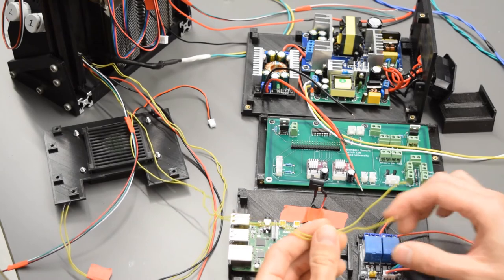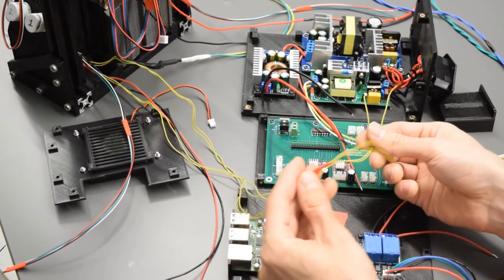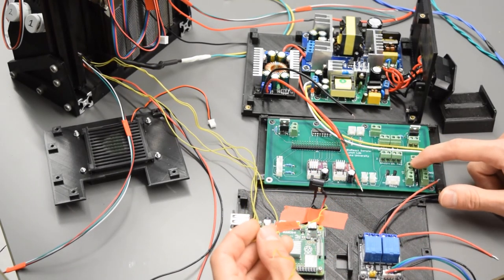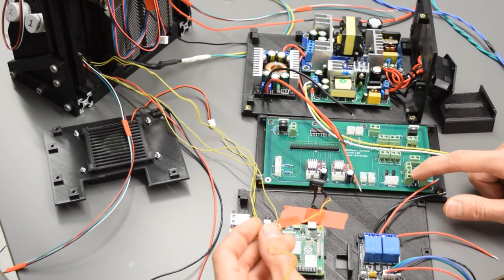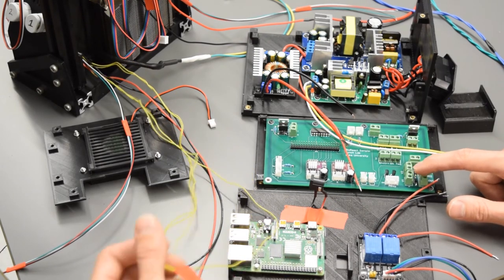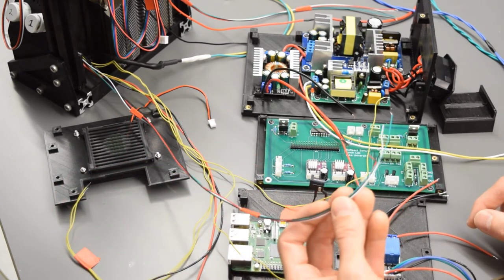make some more connections. So you've got valve 2 is unlabeled here, yellow wires. Valve 1 we labeled previously. So valve 2 is going to go right to this screw terminal, marked V2, and valve 1 to this screw terminal, valve 1. Then the fluid sensors, so they're in the order that the fluid sees them.